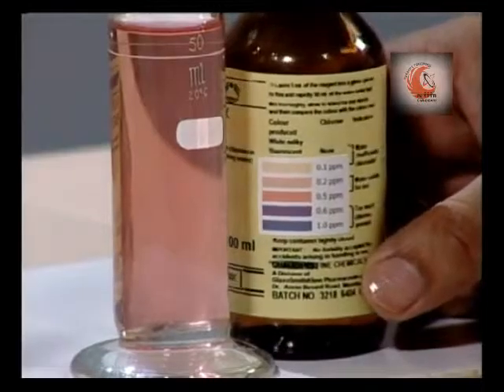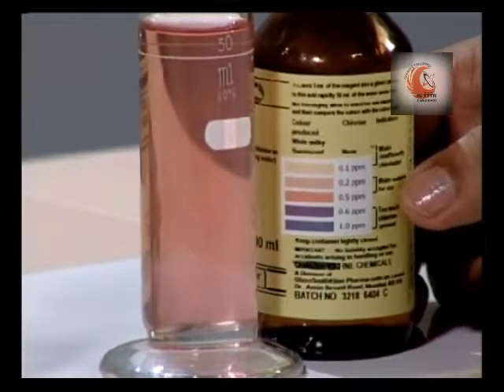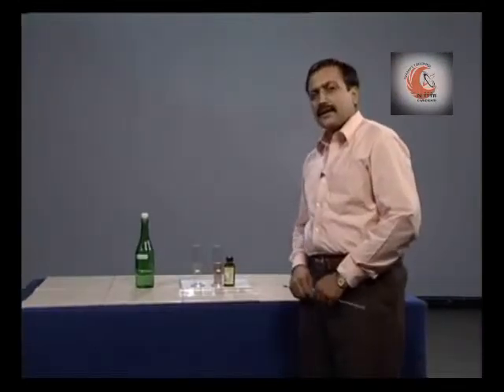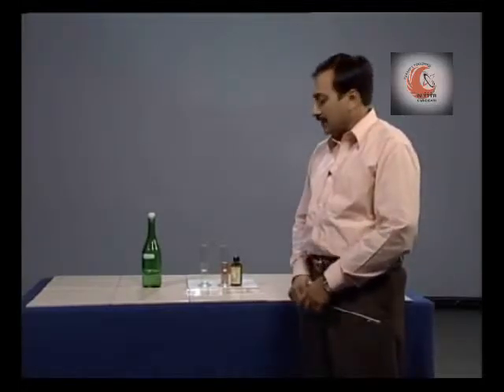Correspondingly, we can see that the water is suitable for use, that is, the chlorine is adequately available in the sample.